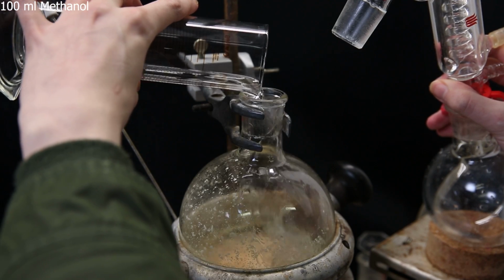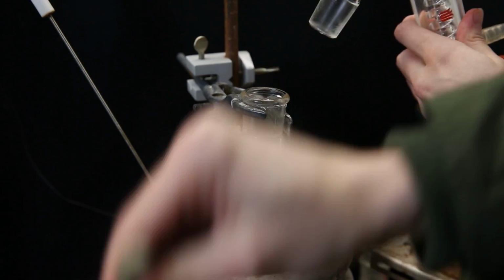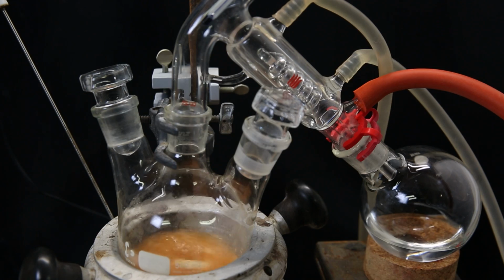Now I dissolve the solid in 100 ml of methanol and it turns orange. I clean the sides of the flask with some more methanol and then distill over all of the methanol.